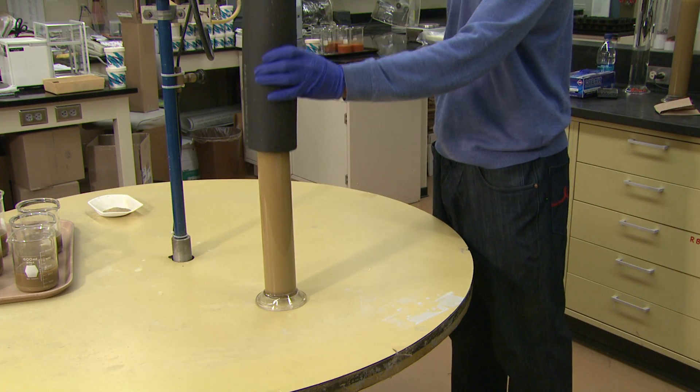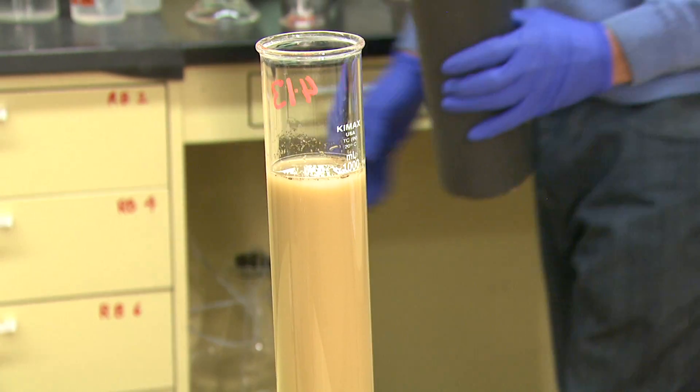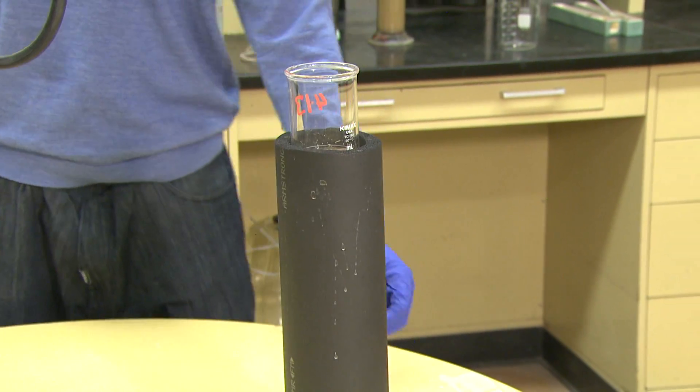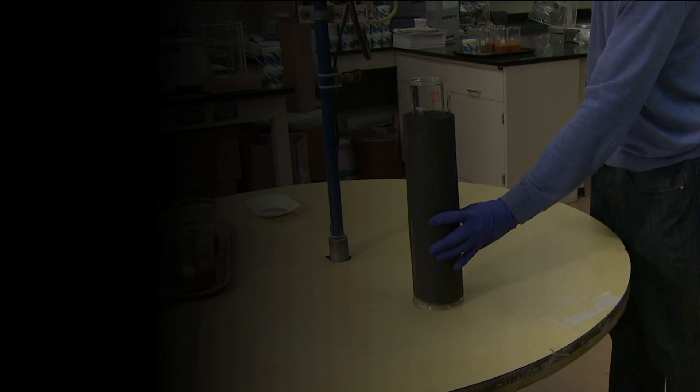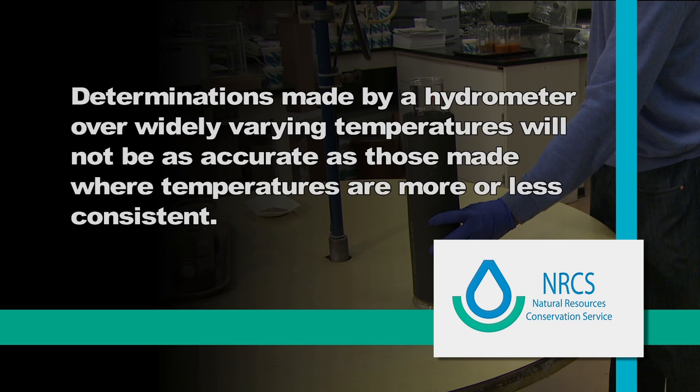After the cylinder has been filled, it is fitted with an insulated sleeve. This is done to moderate or eliminate any temperature changes which may take place during the course of hydrometer readings. This is critical as temperature changes affect the rate at which particles fall or settle in the cylinder. Determinations made by hydrometer over widely varying temperatures will not be as accurate as those made where temperatures are more or less consistent.